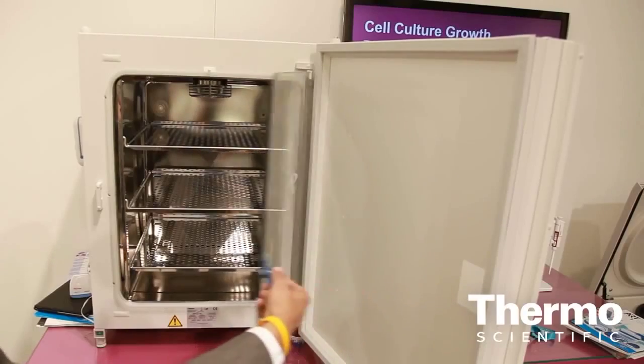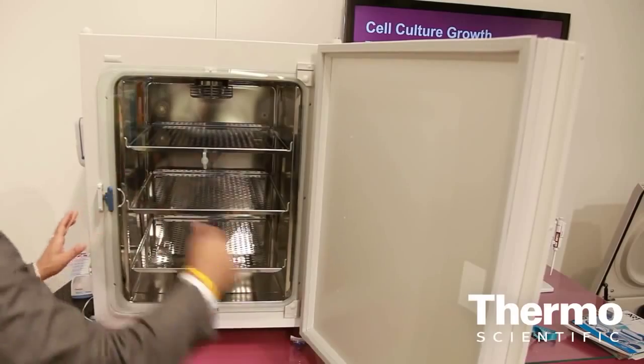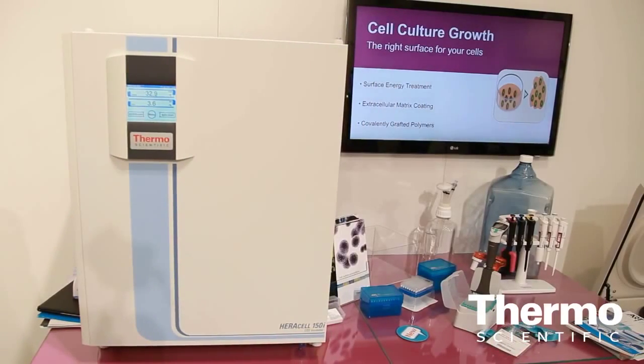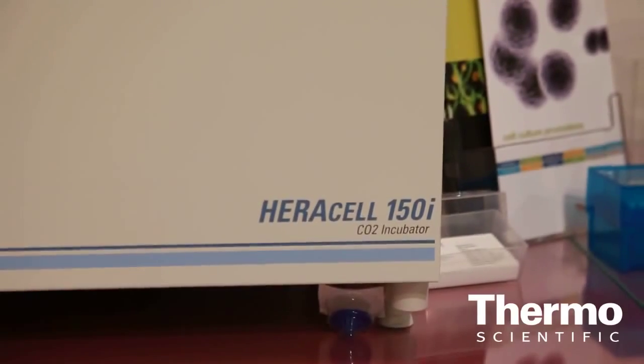As a CO2 incubator manufacturer, we love to have those discussions with our customers, asking them what is it that's giving them problems and issues with their work. And one of the things that we found is contamination — in fact, contamination is the leading concern that comes out.